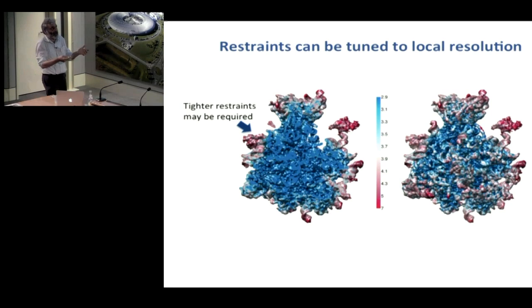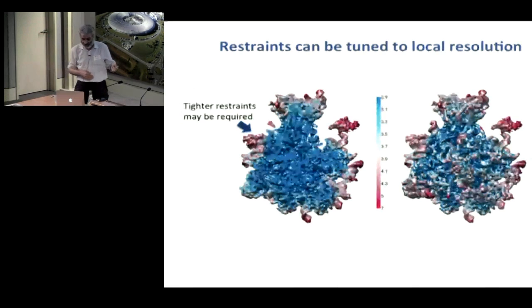And what is the resolution? In fact, resolution is directly related to signal-to-noise ratio, and to how much data you have in the map about your model. If resolution is low, it means that the amount of data is small. So you should use some information from somewhere else, and somewhere else is just structural restraints, using reference structures or secondary structures, or jelly body restraints, or base pair restraints.